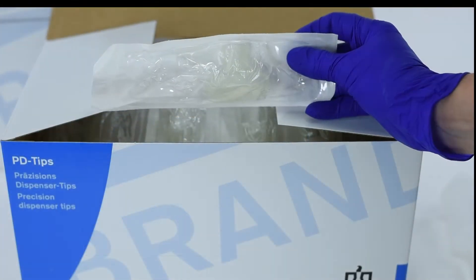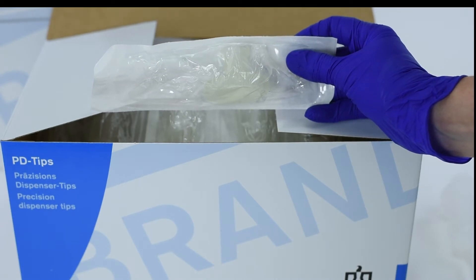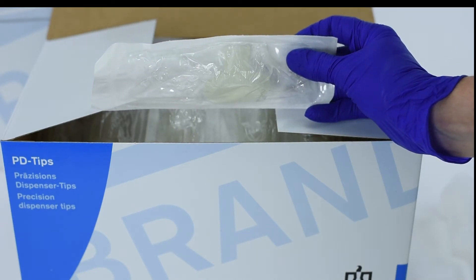While not necessary for sample integrity, sterile adapters are included with sterile PD tips.